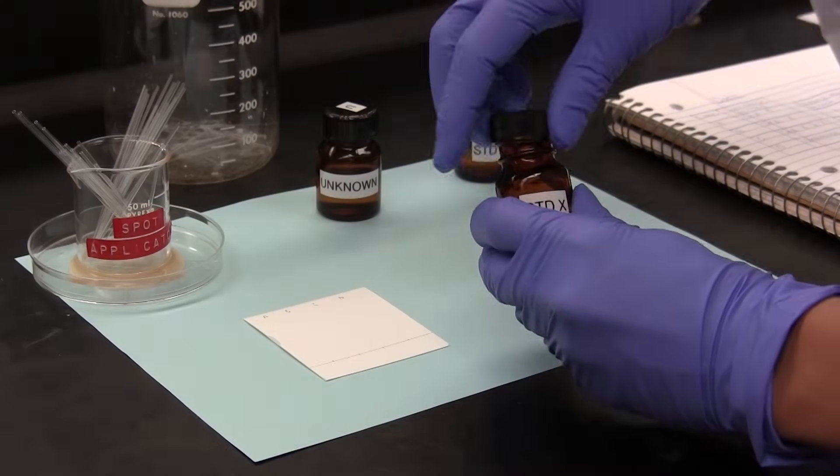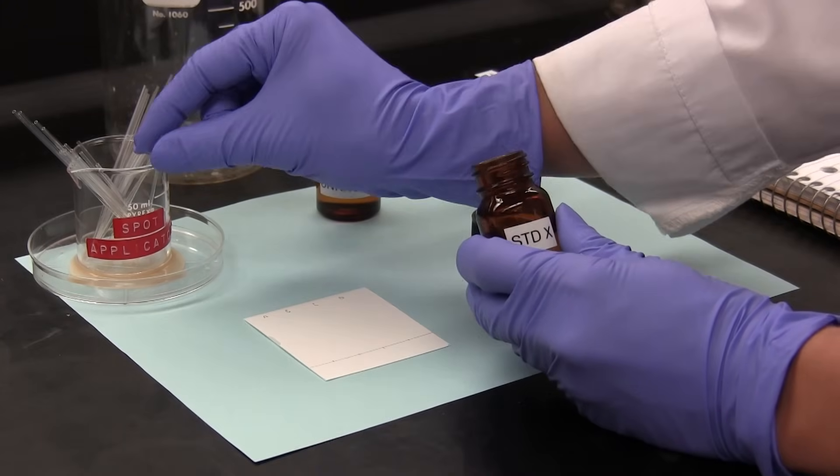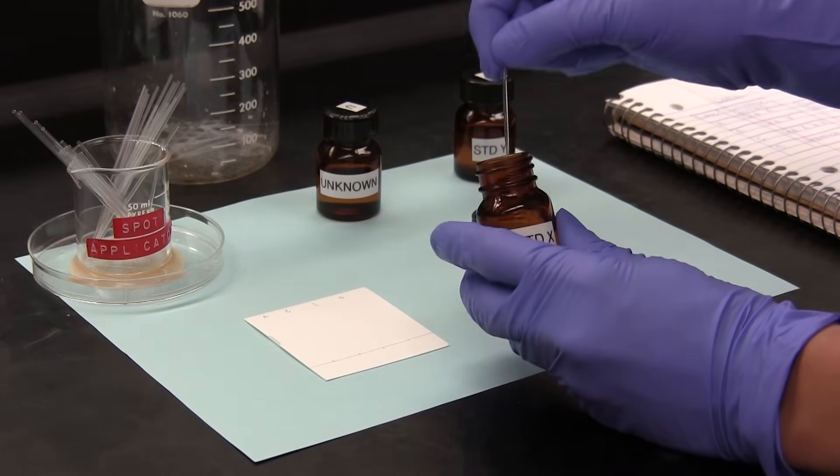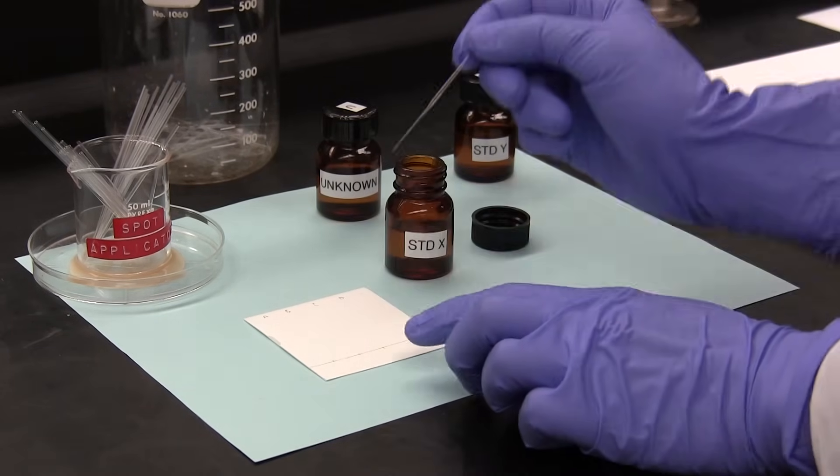The first part of the TLC analysis is to spot the plate. We use a capillary applicator to apply a spot of standard X at the origin in lane A, and again in lane C.